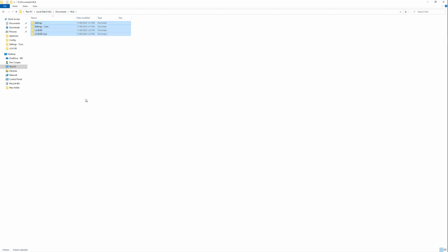And now the next thing that I need to do is create a directory for the new version of the references that I'm going to create. In this case it's version 3.41. So I'll create a new folder, 3.41.00, following the same naming convention as we used for the others. Currently there's nothing in here, so what I need to do is go to the web and download two files.